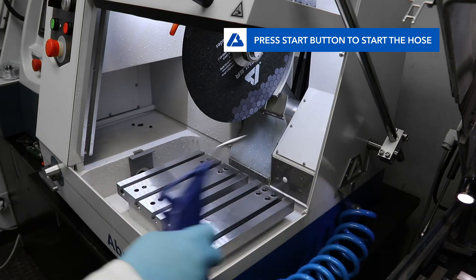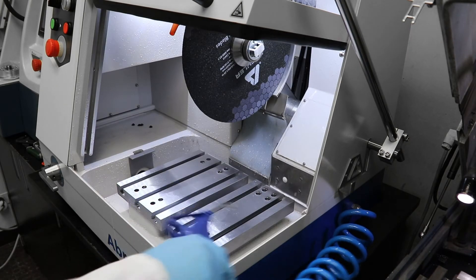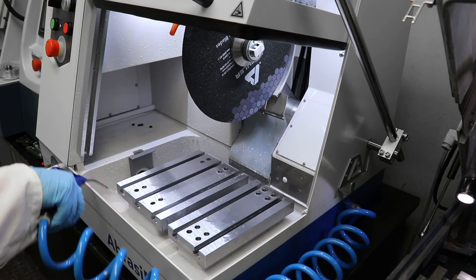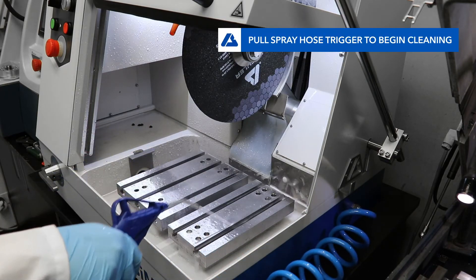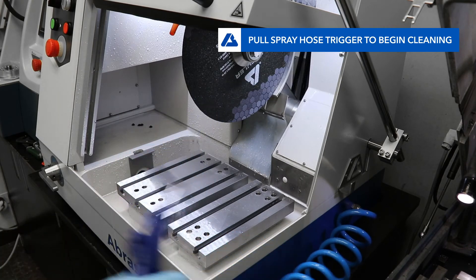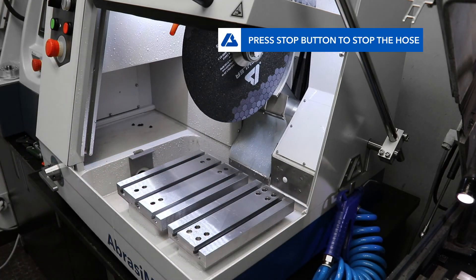This will turn the pump on and direct coolant to the hose; however, coolant will not automatically flow out of the hose. To use the hose, simply point the hose into the chamber and squeeze the trigger to start cleaning. When finished, press the red stop button to turn the pump off.